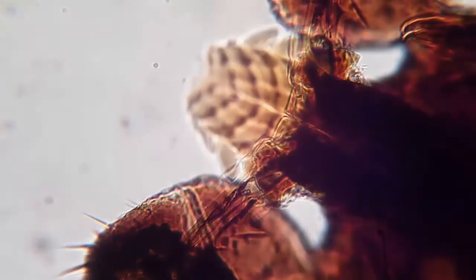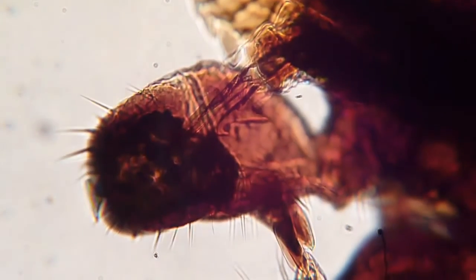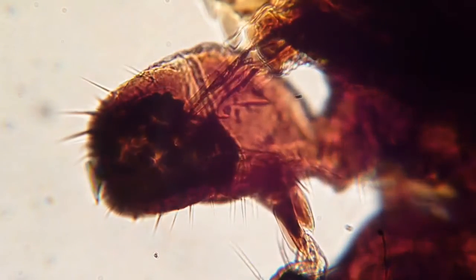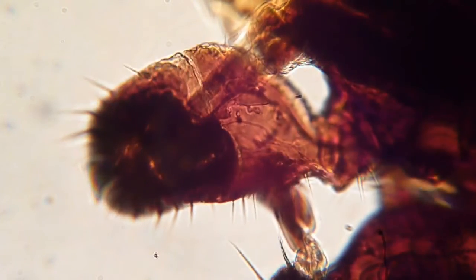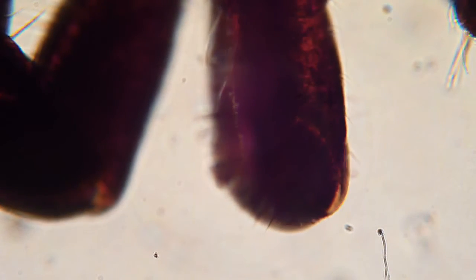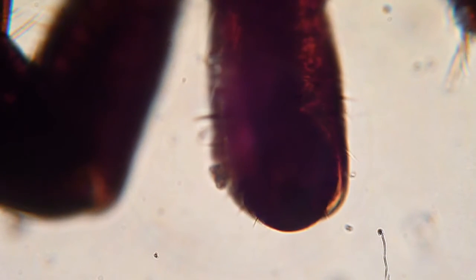Very nice, very well visible. The little hairs that are on the surface of the tick. Let's have a look at the end, the feet. Not a lot of information here.